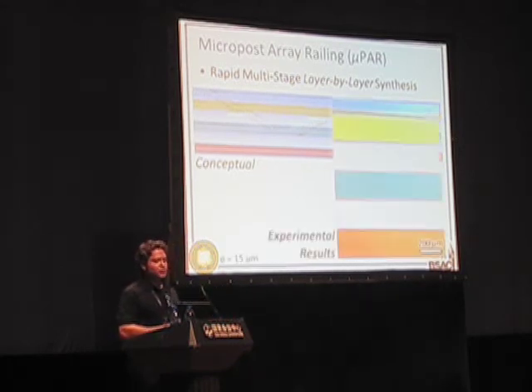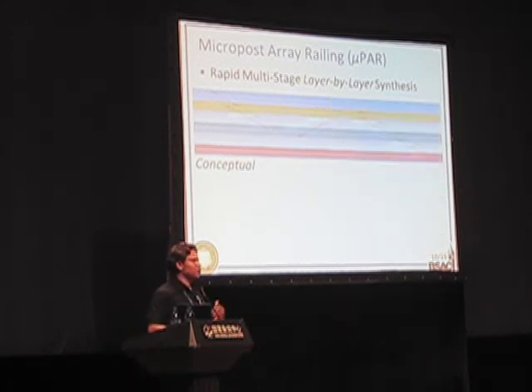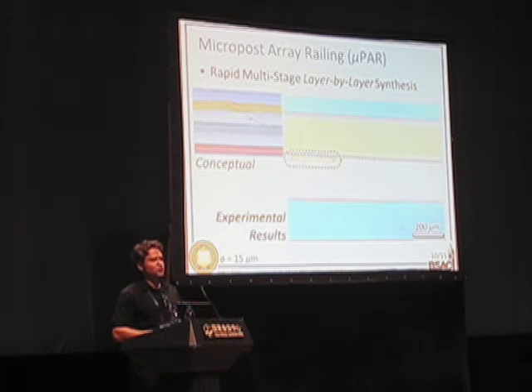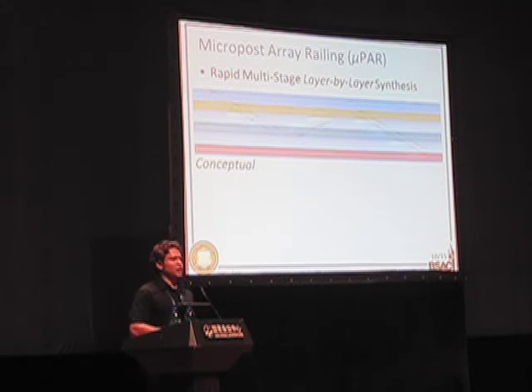First, you're going to see microbeads being railed into the biotin solution. Next, these are microbeads being railed from the biotin solution and then to the wash solution. And then afterwards, these are microbeads that are being railed from the wash solution now to the avidin solution.